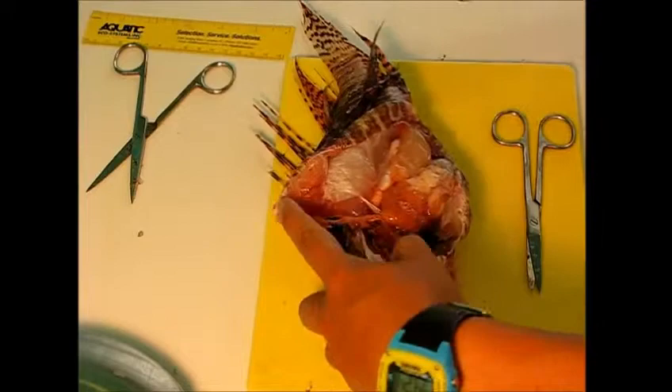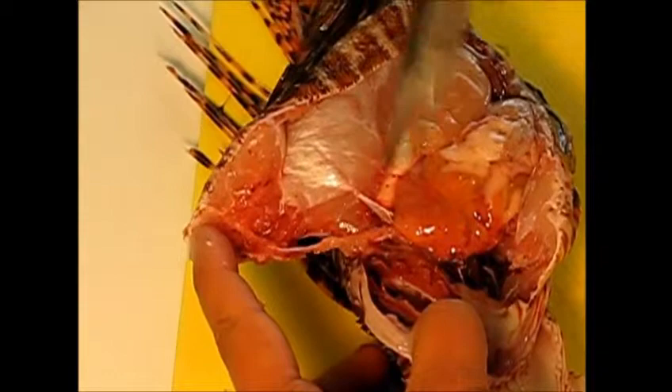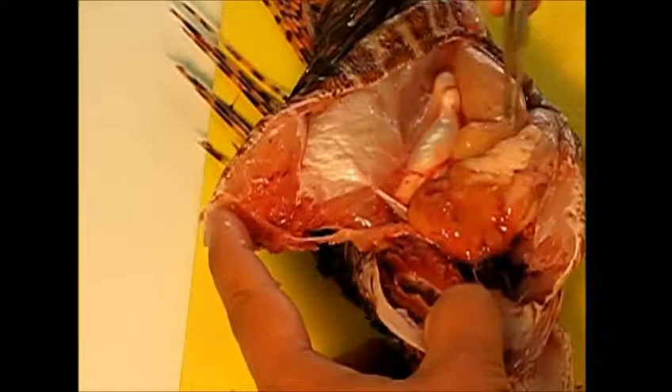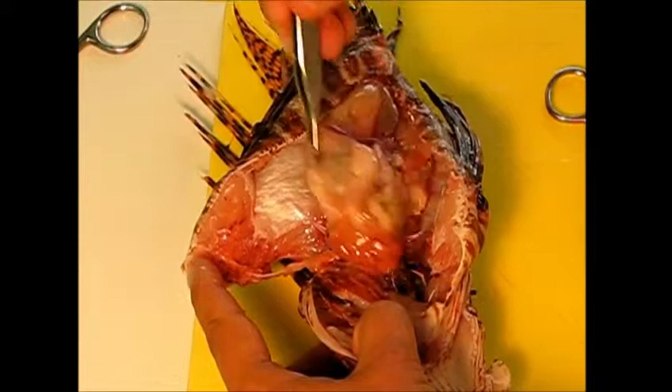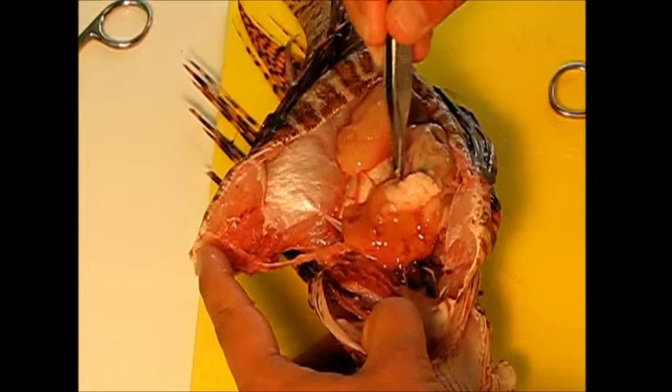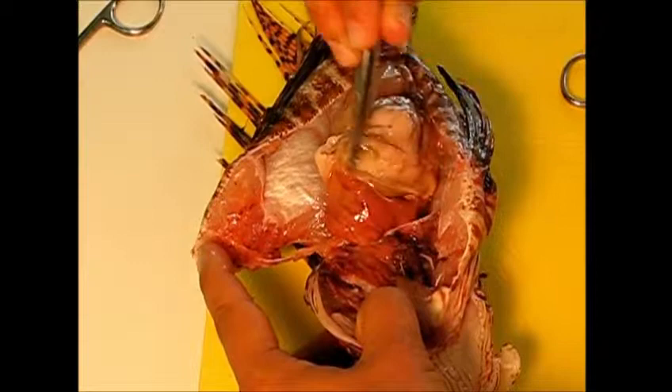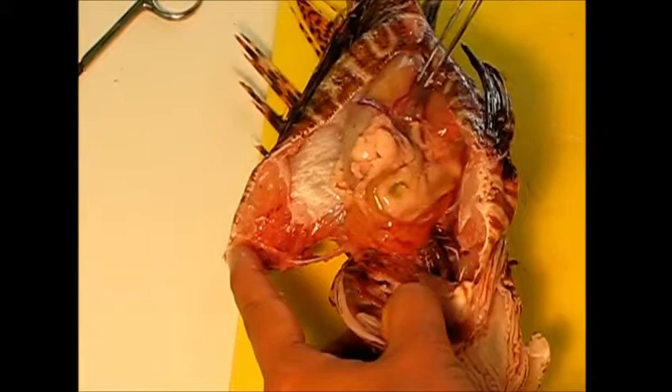Here are some of the internal anatomy features. We have the gill rakers right here. This orange organ is the liver. This right here is one of the gonads — this is a female. This white organ all along here is the swim bladder; they use that to control their buoyancy. This organ right here is the stomach — it can actually expand up to 30 times its normal size. All of this white stuff in here is interstitial fat, and then you can see the intestines.